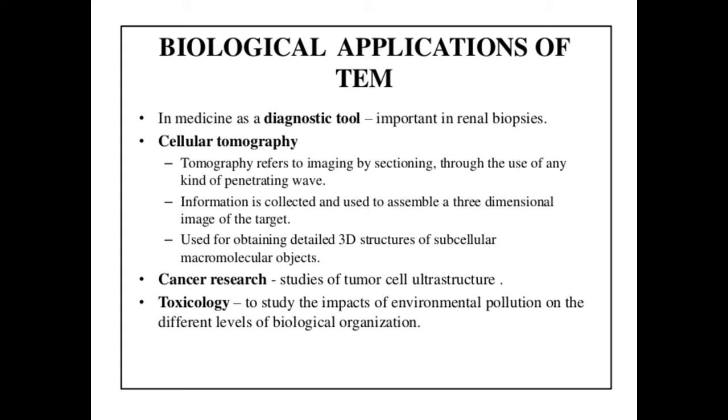Then there are some more biological applications of TEM. You see, in medicine as a diagnostic tool, it is very important in renal biopsies, and in cellular tomography also it plays a major role. We know tomography refers to imaging by sectioning through the use of any kind of penetrating wave. Information is collected and used to assemble a three-dimensional image of a target. This is used for obtaining detailed 3D structures of subcellular macromolecular objects.